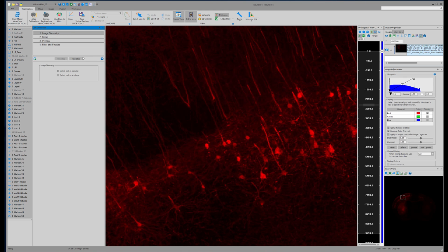And this has a number of different steps. So the first thing is we're going to detect cells in 2D. There's the option of doing 3D cell detection, but the tissue that we have now is not suitable for that. That might be suitable for something like cleared tissue whole mouse brain imaging or something, right? Yeah, exactly. And even confocal images and all.